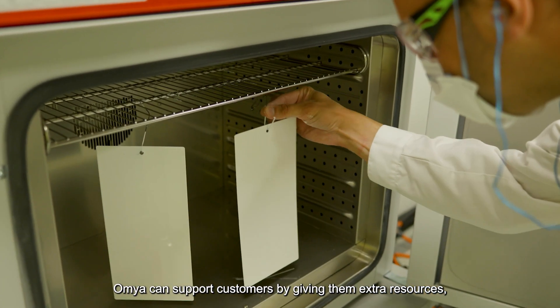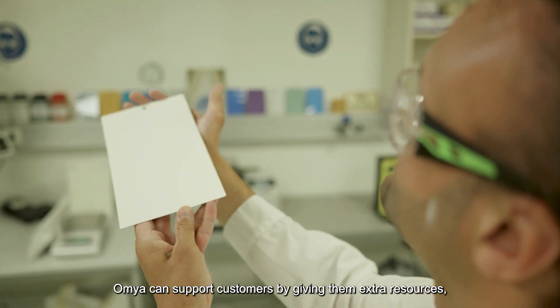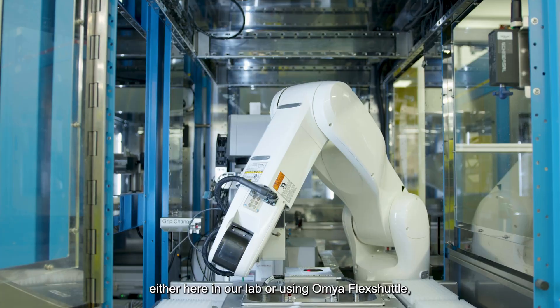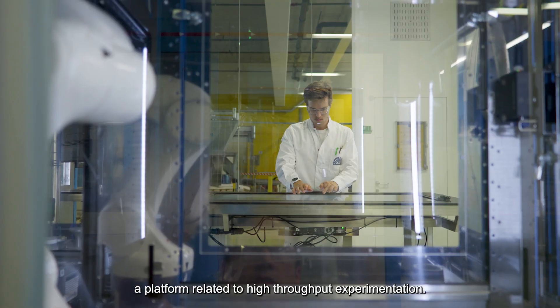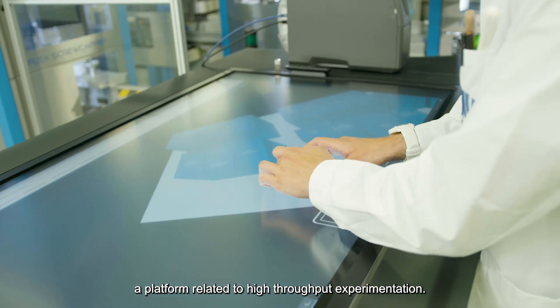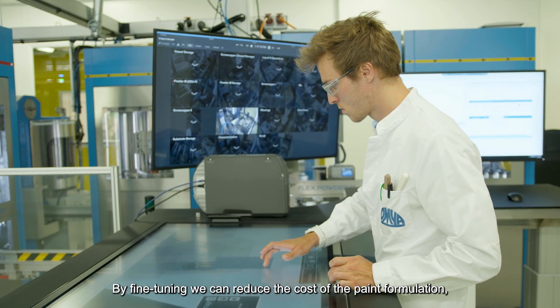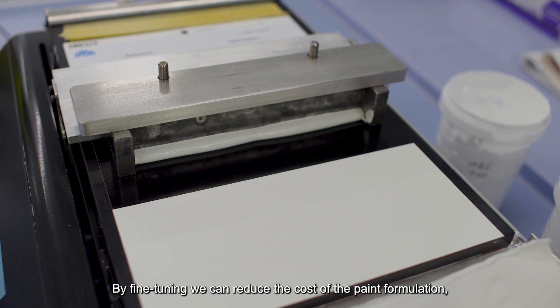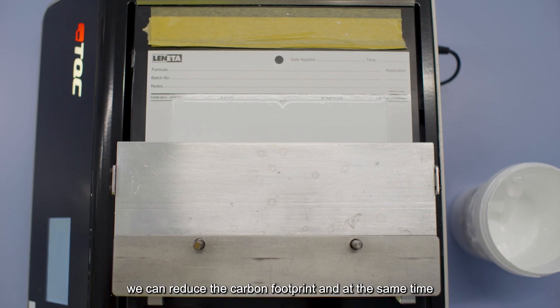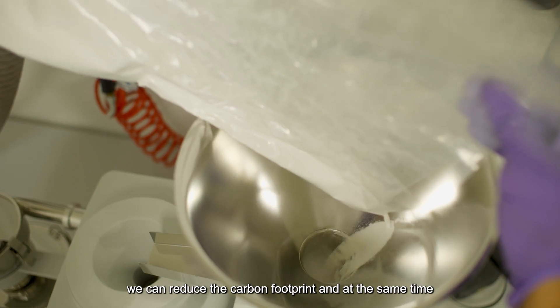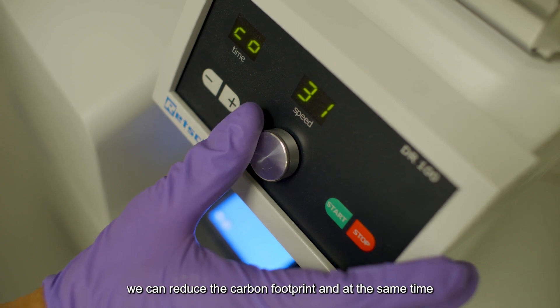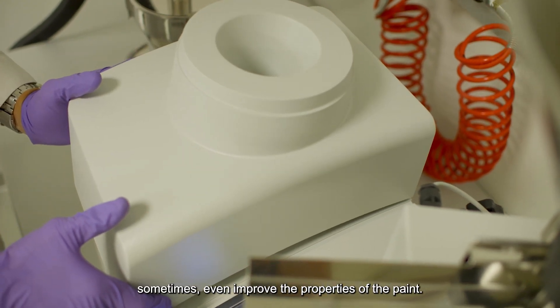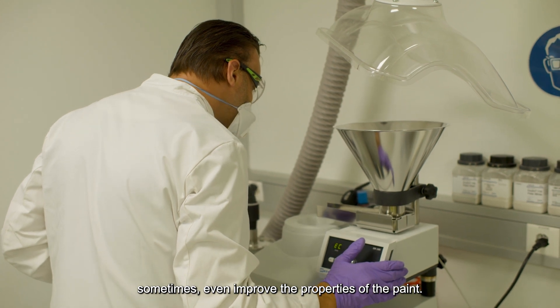OMIA can support customers by giving them extra resources either through our lab or using OMIA FlexSuttle, a platform related to high throughput experimentation. By fine-tuning, we can reduce the formulation cost of a paint formulation, reduce the carbon footprint, and at the same time keep the same properties or sometimes even improve the properties of the paint.